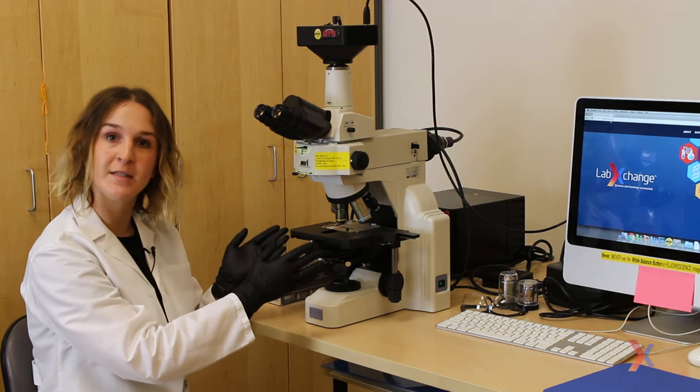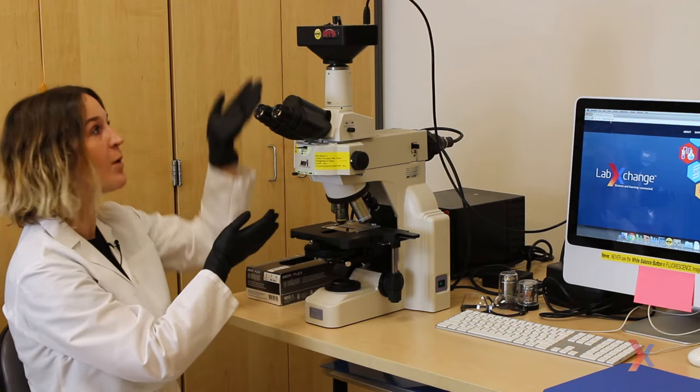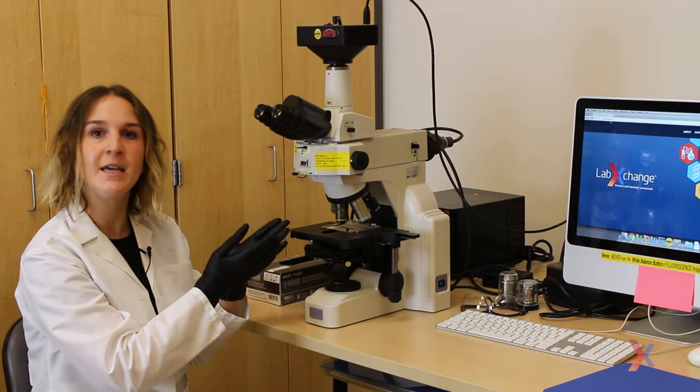For example we want a nice even illumination on our sample and then we want to collect the light that's transmitted through our sample with an objective lens and then we want to focus that image of our sample onto our detector.